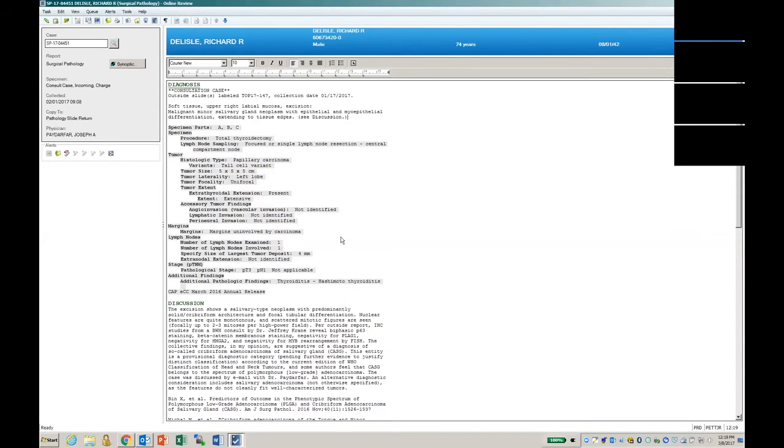And I don't know how much you've talked to Mike about this, but another interest we had in going this route is that everything that I'm putting into these structured data fields is getting populated into a SQL database, into the Intuitive database. And actually, I have one of our LIS folks here, Jeff, with me in my room, who just started doing queries on our database. So we're finally getting access. We have a year and a half to 2 years of data for some of our specialties, and now we're able to start doing some neat things with that data for specific specialties. So anyway, I guess I'll leave it at that and open it for questions.